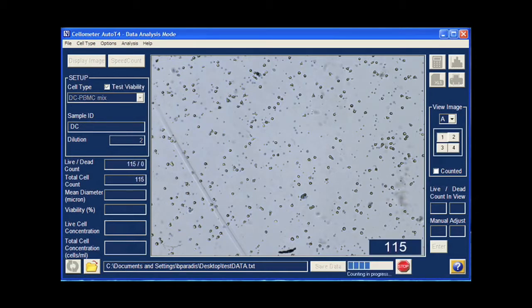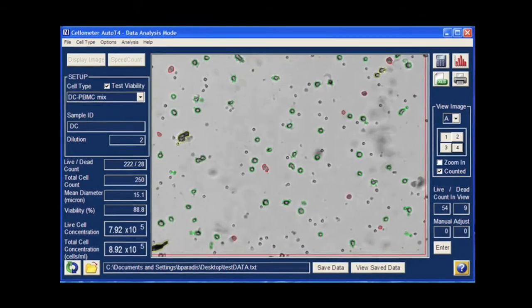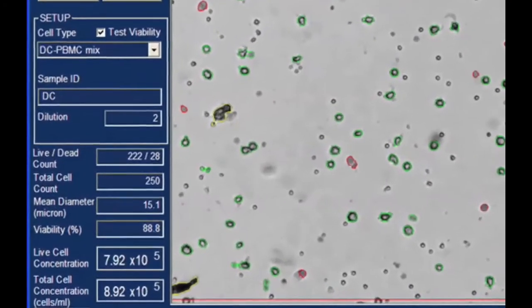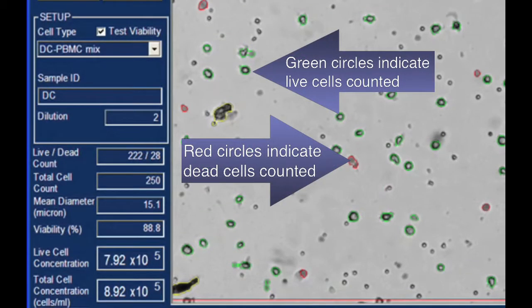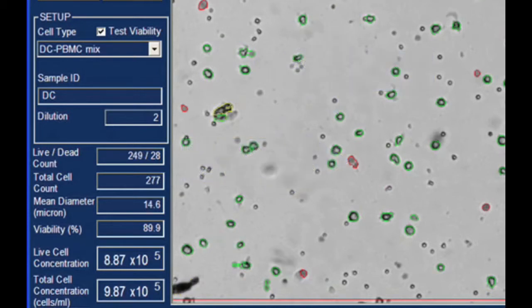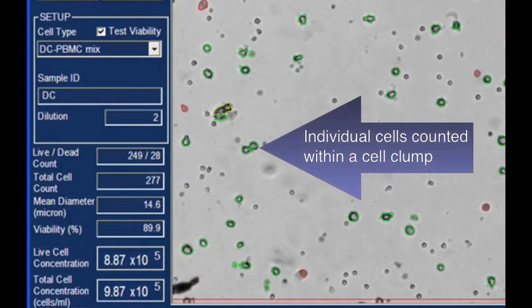The T4 counts all the cells in the brightfield images to determine total cell number. The brightfield counted image indicates individual cells counted. Users have the option to count cell clumps or count individual cells within clumps.